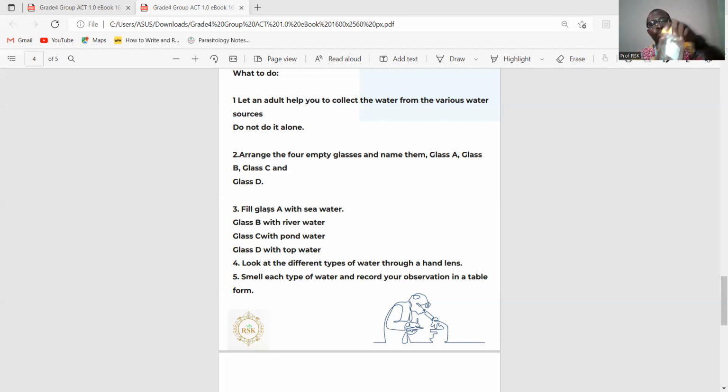So I think that the tap water has everything that we are looking for. The color is colorless. There are no particles in it. We didn't see any particles moving through it. It is colorless. We didn't taste it, so we put dash over there because we didn't taste it. What again? It has no scent, okay?